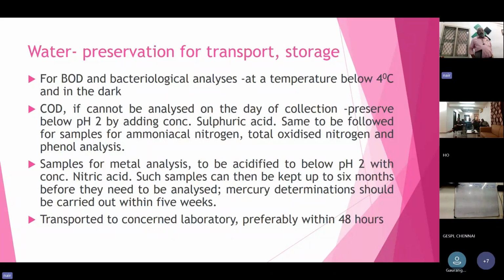Then, once the samples are collected, you are sending them for analysis to the laboratory. So they should be preserved. Earlier I told what a sample is: a representative one. And regarding transportation, there should not be any change in the characteristics of the sample, and you have to ensure it. So you have to do some preservation also.